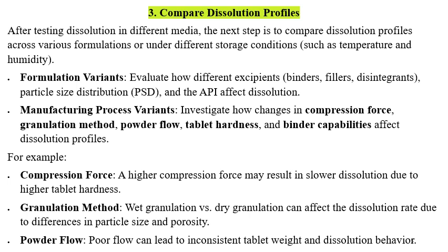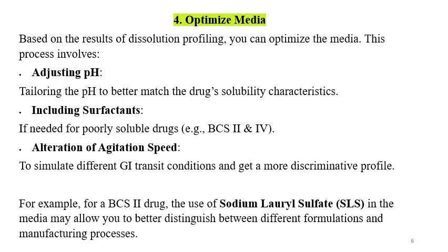Powder flow can be improved and tablet weights are required to be controlled, but for sure the granulation time, compression force and the storage conditions can be considered as variants for dissolution profile comparison. For insoluble drugs, mainly the particle size is considered. Optimize the media is the fourth step.